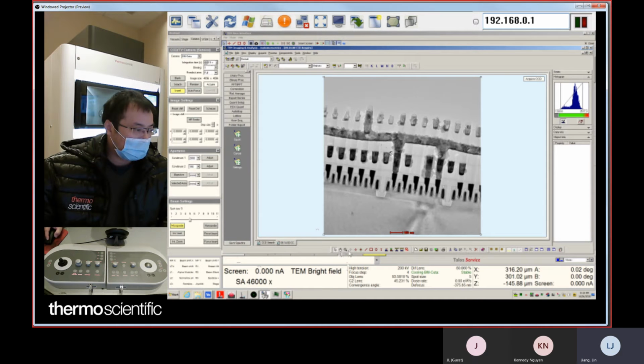You can put a spot in. Yeah, you put a spot. You go here, put a star, and you can go here. This is your spot, right? You can search your spot. You can put a spot in the brightest spot, like here. You can take a look at your intensity here. And also you can read the dose.